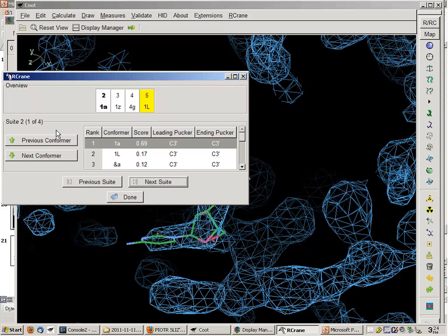What you can do is tweak the backbone conformers, which is, you can see the window that's popped up now. We'll let you do that. But at least right now, there's no simple way after it's built to go back and tweak those things. I can show you in a couple minutes some way to go back and tweak a couple things along those lines.